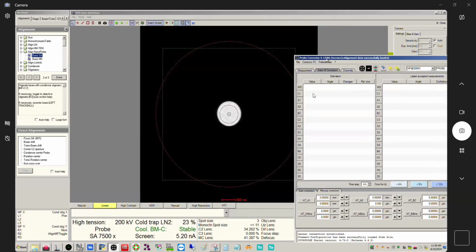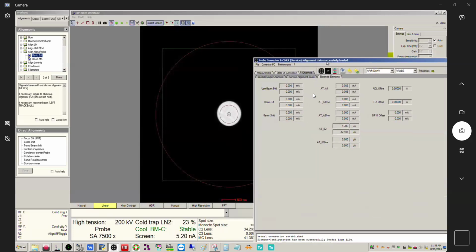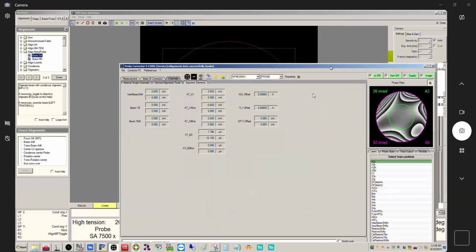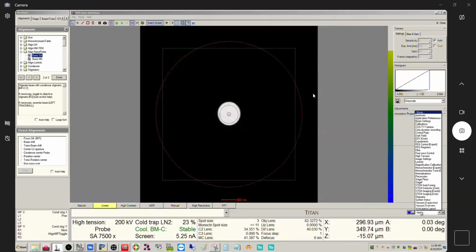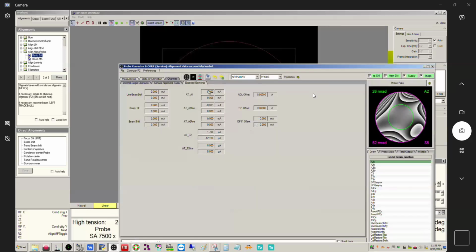Now here again, if we're not careful, we go here to exported elements. It's asking us to correct with the condenser stigmator. So you can see, whoops, no, user multifunction, not intensity. You can see this is changing here. So if I minimize this and pull up the stigmator panel right here, if I right click, I just click reset. Now that should... no, it didn't put it back.